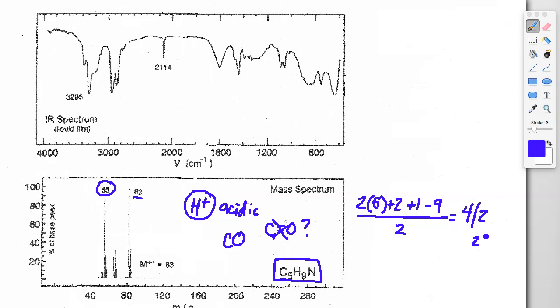So let's go ahead and move forward to the IR, which is actually at the top here above the mass spec. So when we take a look at the IR, there's 2 really important peaks here. The first one is 3295. So at the 3295 inverse centimeter, that wave number is correlating to something that is north of 3000, and that usually means it's going to be a hydrogen attached to a carbon, and that carbon is going to be involved in some sort of a pi bond. It's usually sp2 or sp hybridized. Okay, and around the 3300 region, you can have aromatic, but a lot of times it's going to be an alkyne, so a terminal alkyne, and this would also make sense because that proton there is mildly acidic. It's not super acidic, but it certainly could be removed, and you could have a resonance stabilized ion that's occurring there. So that would make sense.